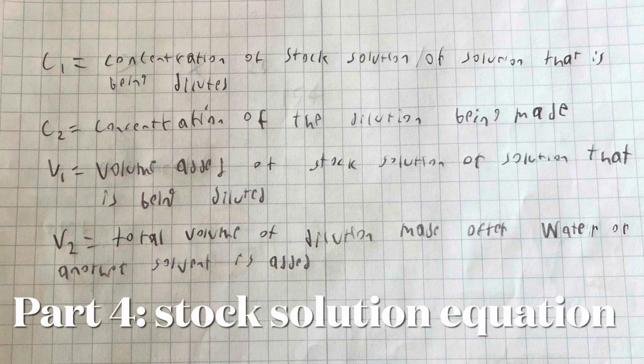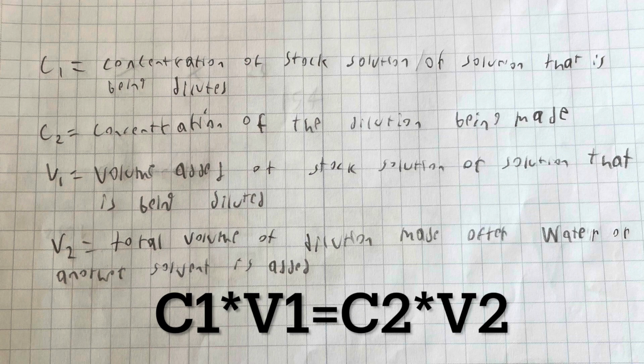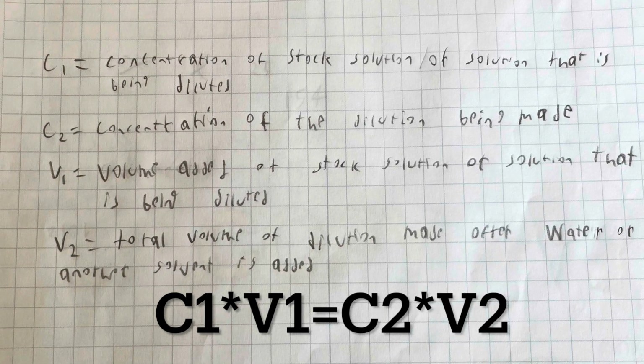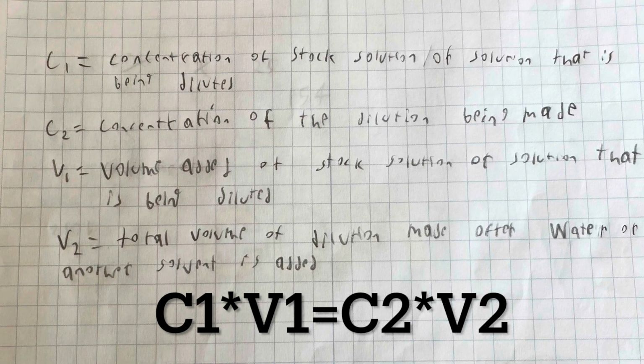Stock solutions are accurate concentrations of a solution which can be used to create a dilution. A dilution is created when a substance such as water is added to a certain amount of the stock solution in order to decrease the concentration.